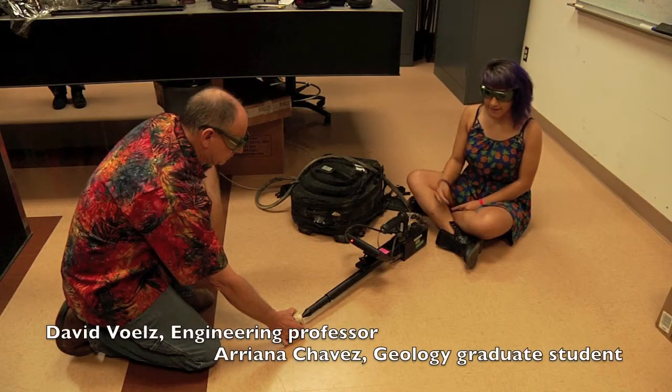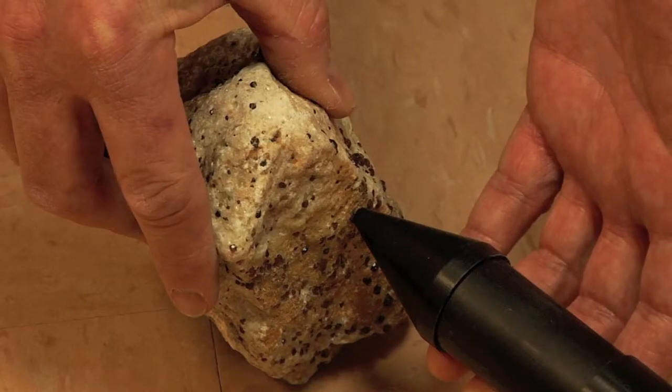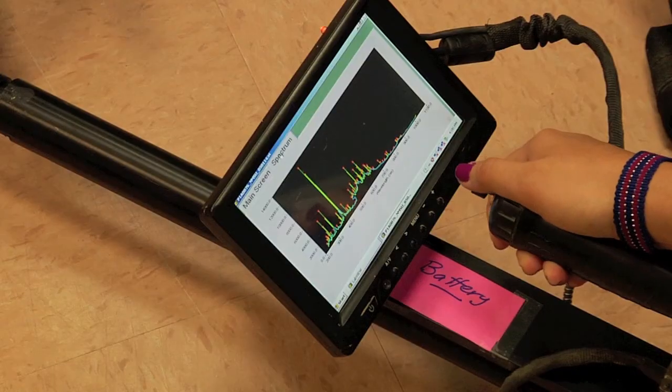And so basically what happens is that we shoot this laser here. As it passes through, it analyzes the sample, and that light comes back through the lens. The screen's right here, and so it comes to the screen and we could actually see the spectrum that we got.